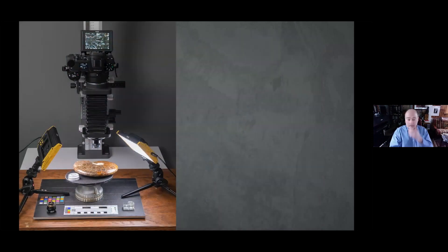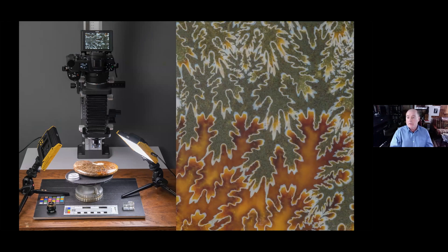Here's the stage in action. I have different top plates and one solid bottom plate, but you can create really interesting pictures just by tilting to get your maximum depth of field. I still do a lot of stitching depending on the specimen and the type of magnification, but the tilting stage has really saved a lot of time in making sure your specimen is in the right position.